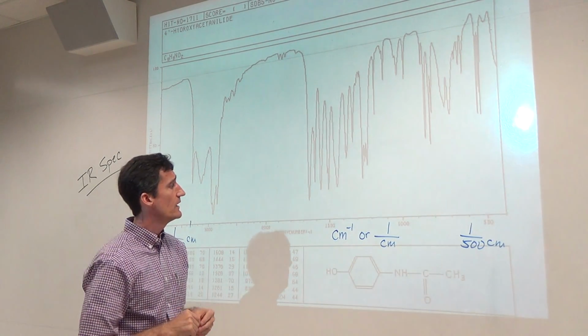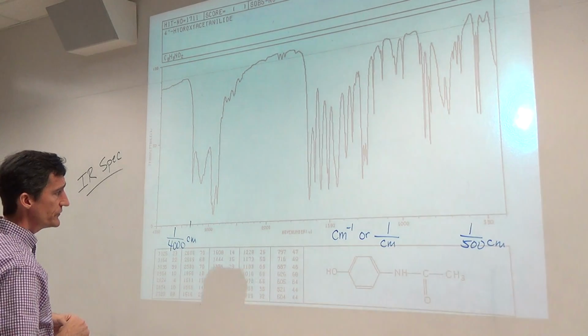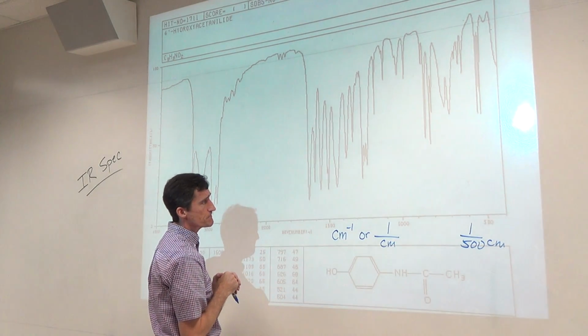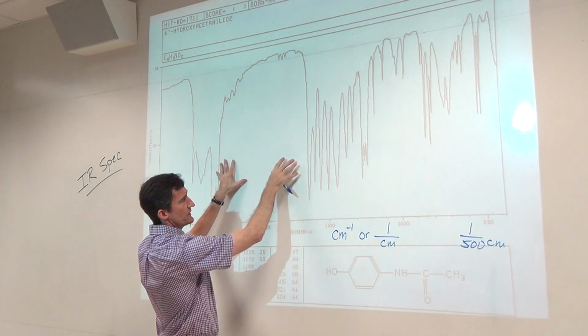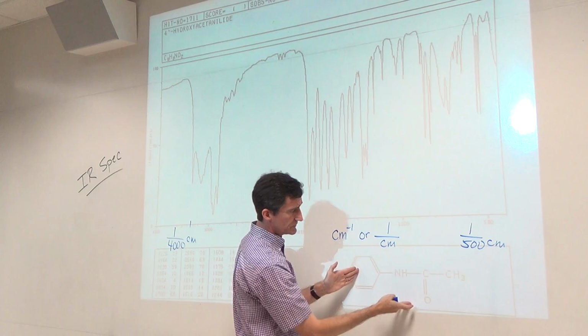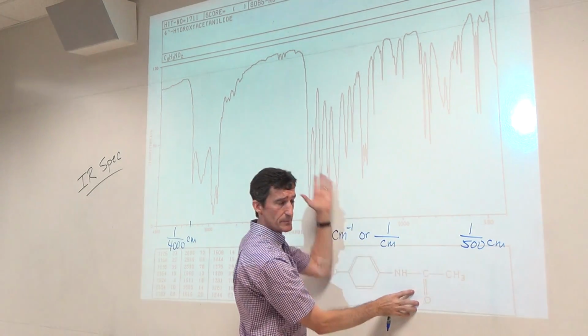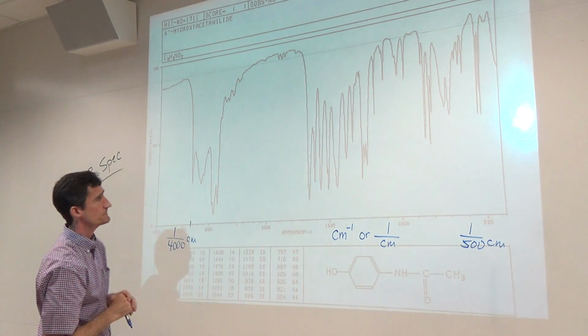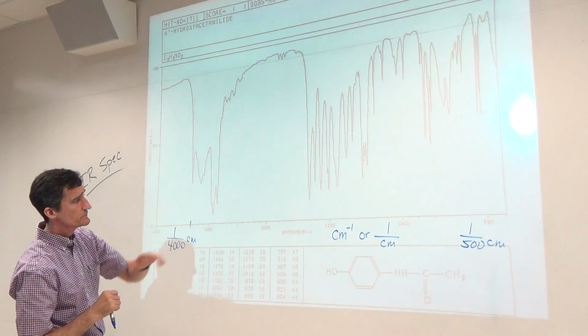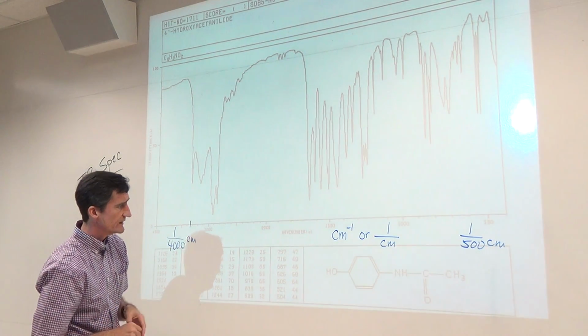And we will have to figure out and learn what each type of peak means. That can be done by looking at peaks and then deciphering what the structure is. At times we'll also look at a structure and say, okay, what type of peaks do we expect here? For example, I'll go ahead and label this IR, just for introductory practice.